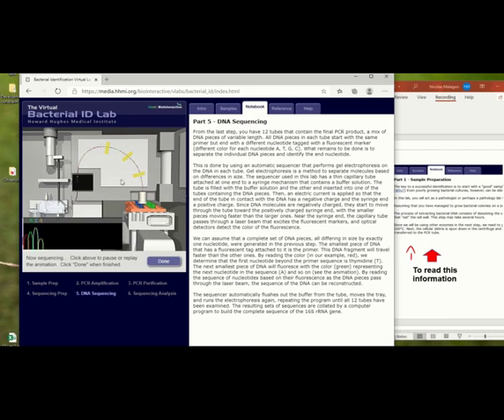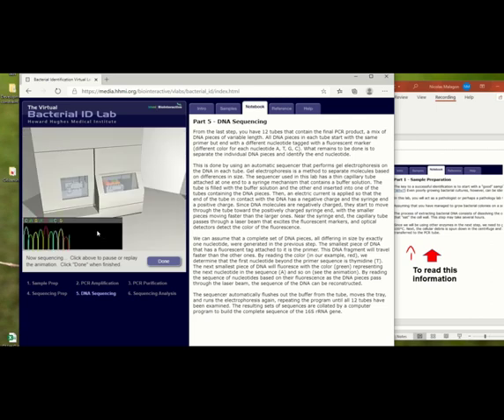And here, as this DNA sequence, they have a special fluorescent. They will give a specific color, and you can see all the T's, A's, C's, and G's. Before, this was done manually and took hours. Now a computer is doing this, and now we can have in a few hours these results.